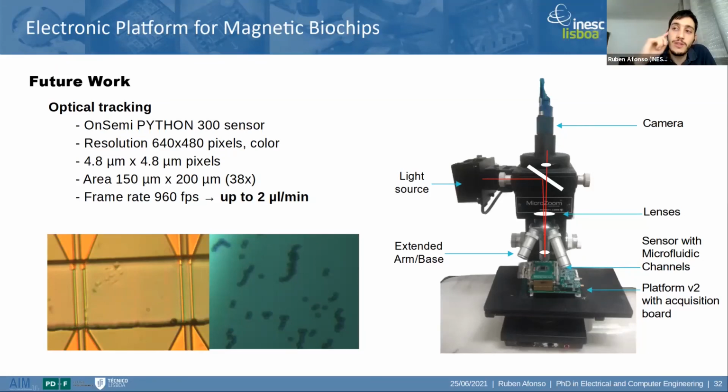Yes, increasing the frequency will be the best step to accommodate more flow rate. Using higher flow rates, some problems with the microfluidic channels also do not apply.